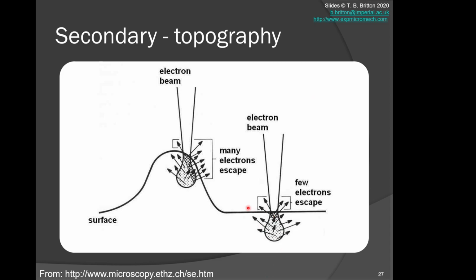In this example, the surface area where the electrons can escape is such that fewer are escaping and hitting your detector up here, so this will be less bright. And if you were looking at this point and you had the detector over in the top right, of course this would look darker. So you effectively get that sort of pseudo 3D shadowing associated with the position of the ETD with regards to the surface topography present in this sample.